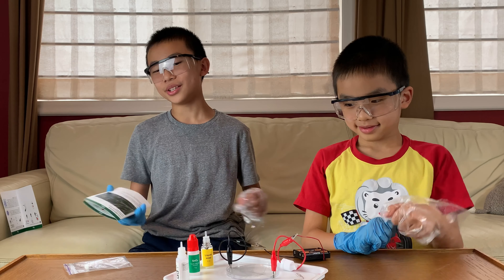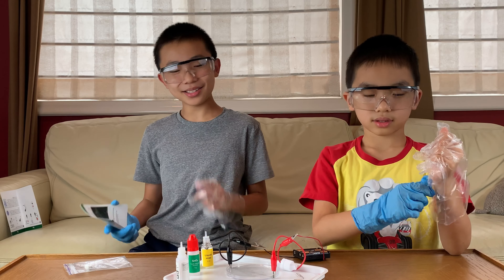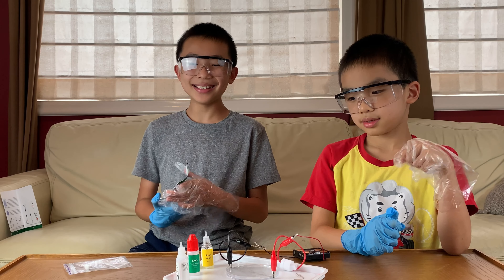Coming into this I actually wasn't too excited, but this is worth the danger. It's so cool.